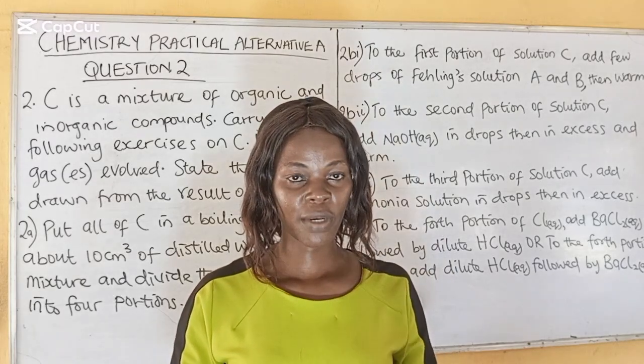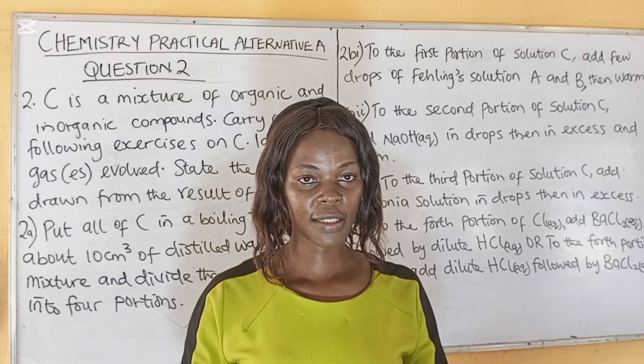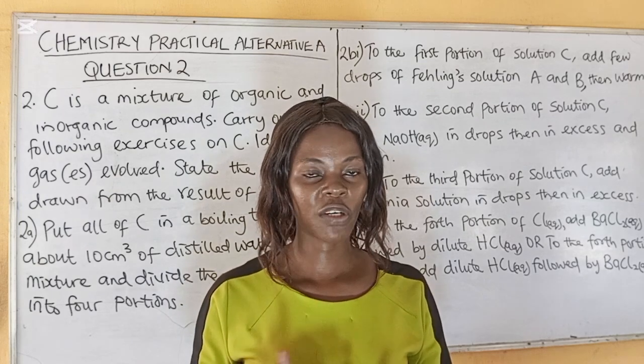For this exam we're about to write, Chemistry Practicals Alternative A, we are going to look at qualitative analysis. So let me usher in my mommy so she can guide you through what you're supposed to do for this particular exam.